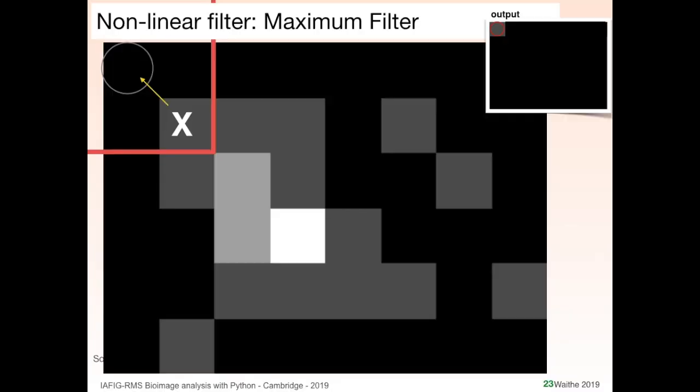And what we're going to do is we've got a kernel of size 3, and we're starting in the corner. The way that this maximum filter works, which is the beginning of the find maxima pipeline, is we're going to move this kernel around, and the center of the kernel, in terms of our output image, relates to here, and this circle here represents our first output.